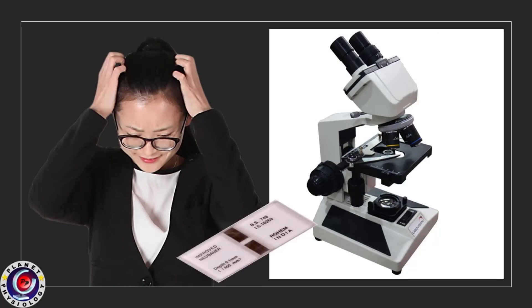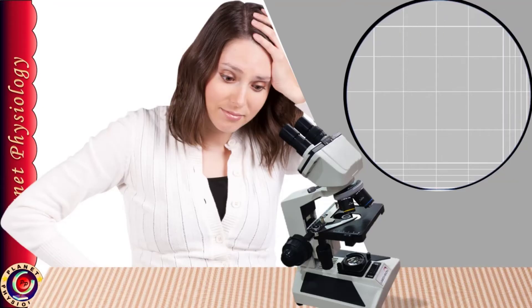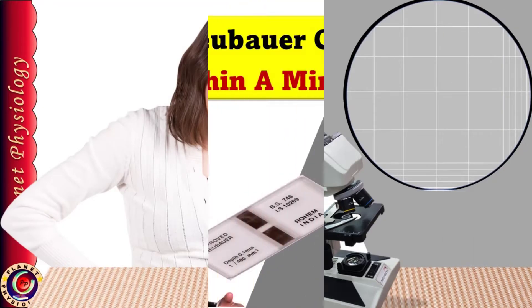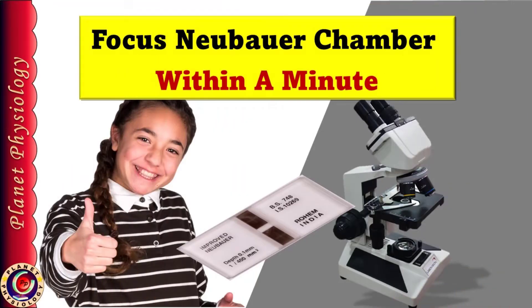Do you get frustrated while focusing the Neubauer chamber or do you feel it is very time consuming? Then this video is definitely for you. Today I shall guide you step by step so that you can focus the chamber within a minute.